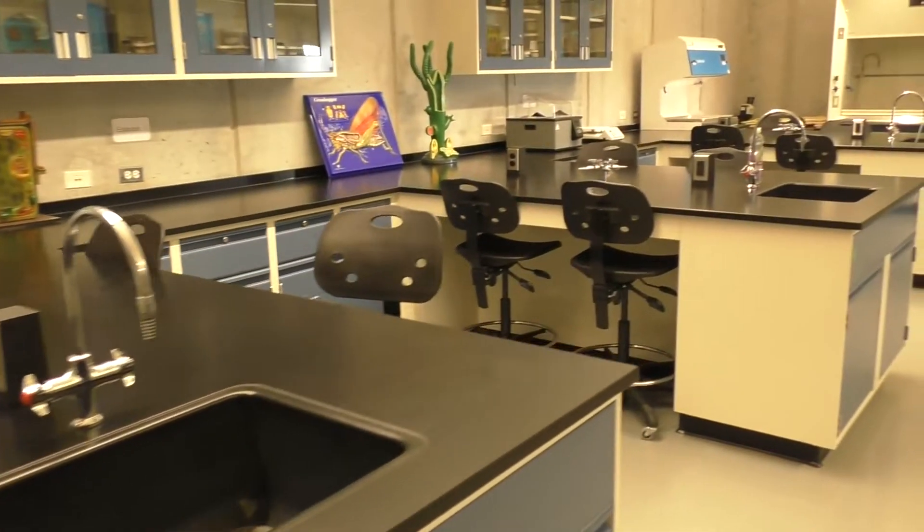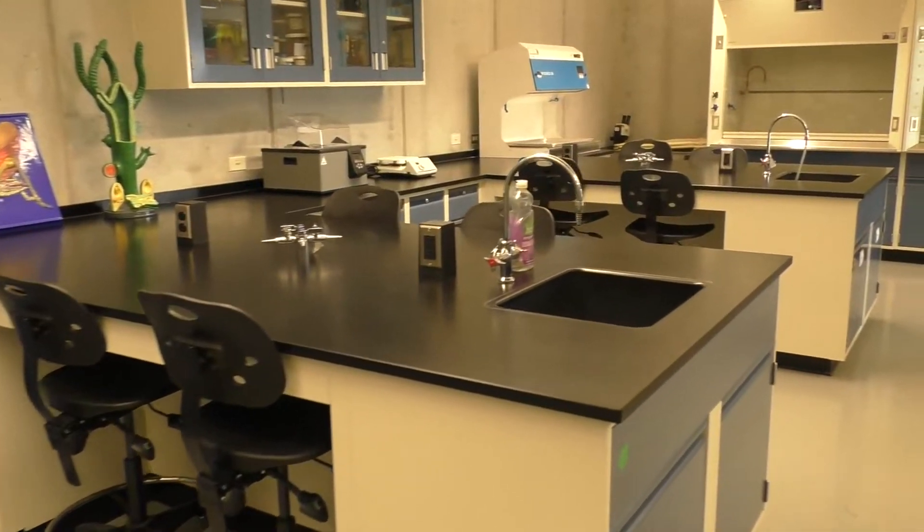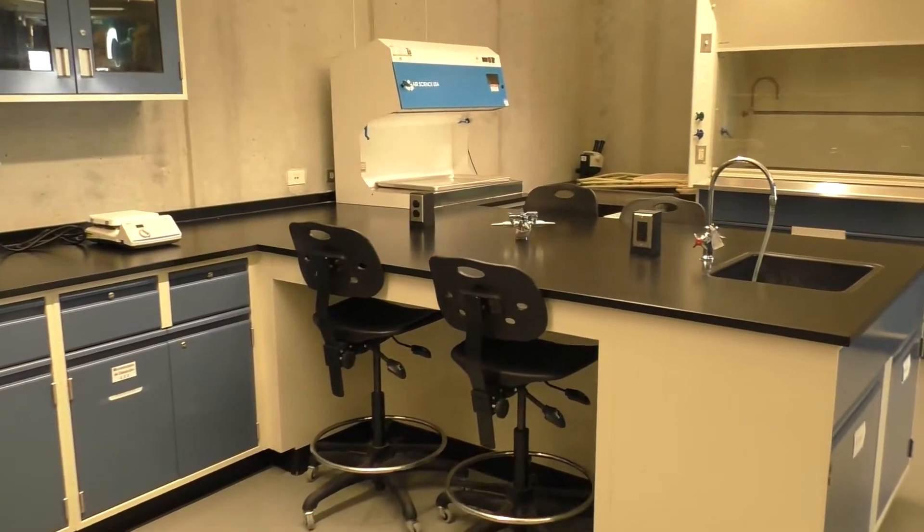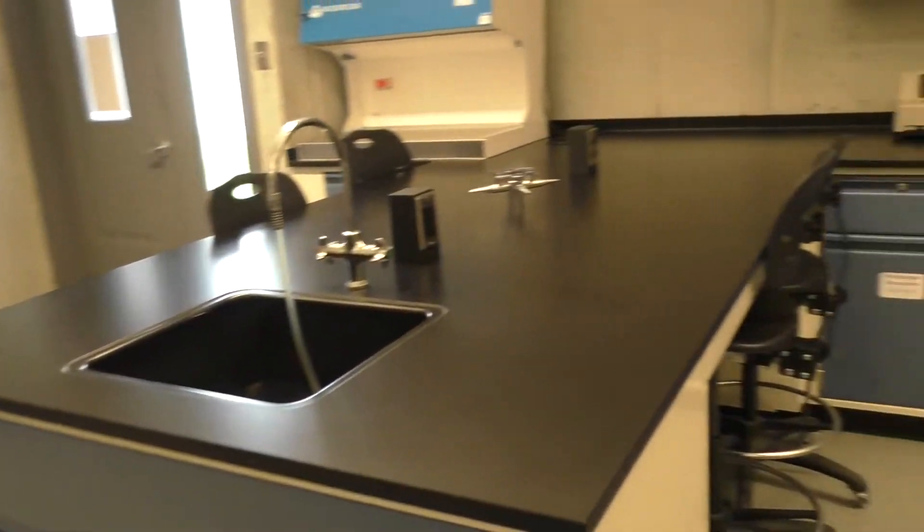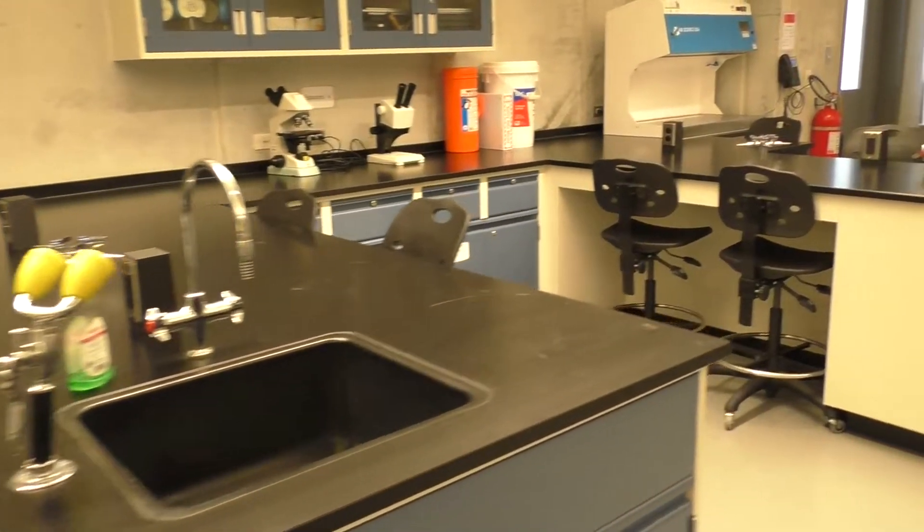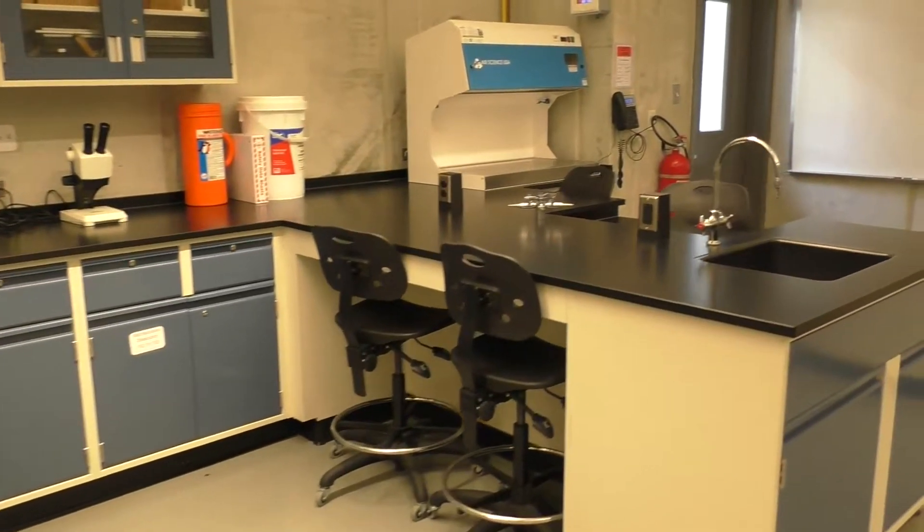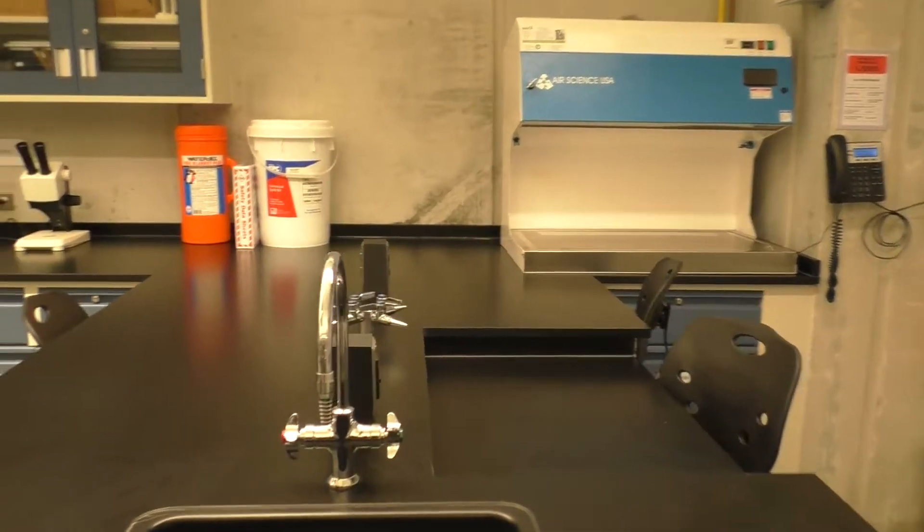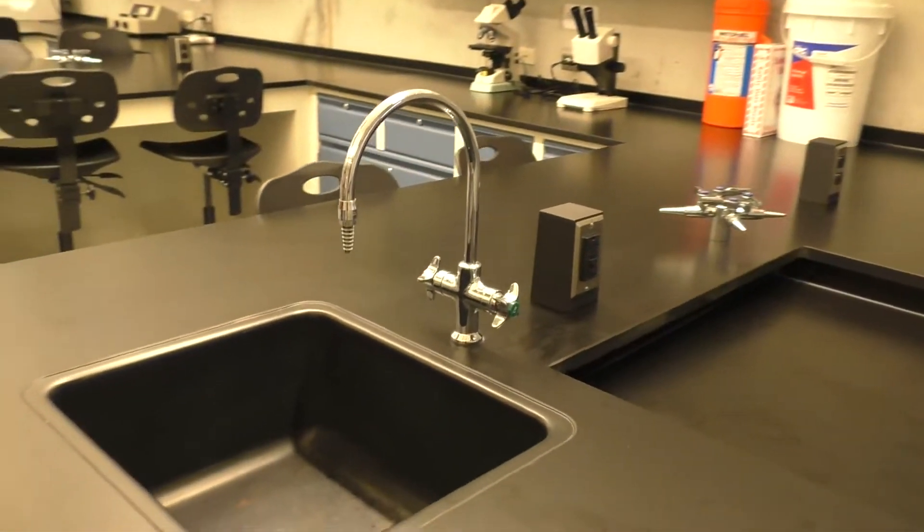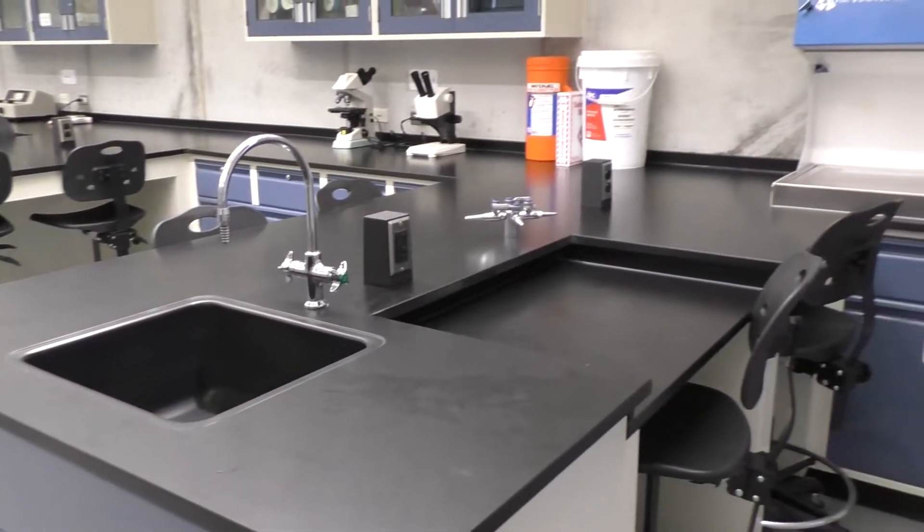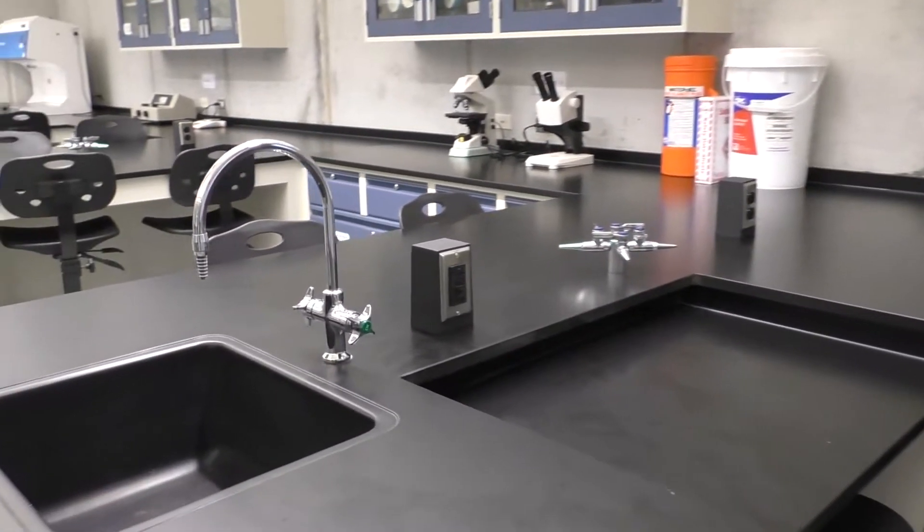The work area for the students consists of six stations, each with four seats. Each station has its sink, electrical outlets, and gas tabs.